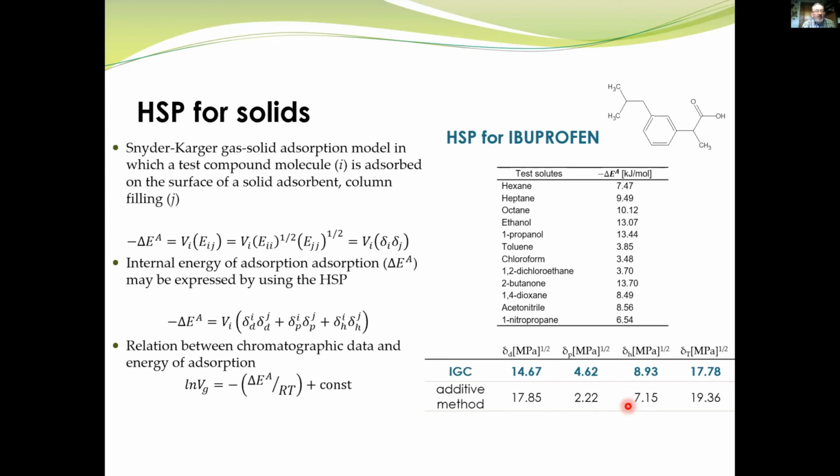If we have a real solid, these equations shouldn't be applied. And very often I found in journals strange publications where these previous equations were used for solids.